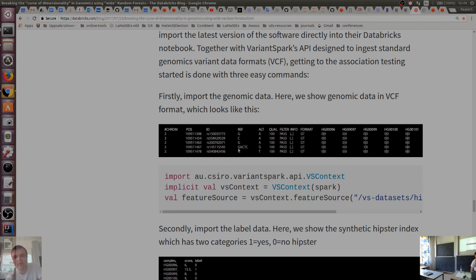And actually here, it's also one of the variants you can find, an indel. So in the reference, we have 5 nucleotides, but in this particular sample, instead of these 5, we have only G. So as you can see, what happened to this sample, there was a deletion. So 4 letters were dropped from that position in that sample. So sometimes you may also have not only single nucleotide polymorphisms, but so-called indel variation. So insertion or deletion. Some letters can be inserted or some can be deleted. But this is some extra.